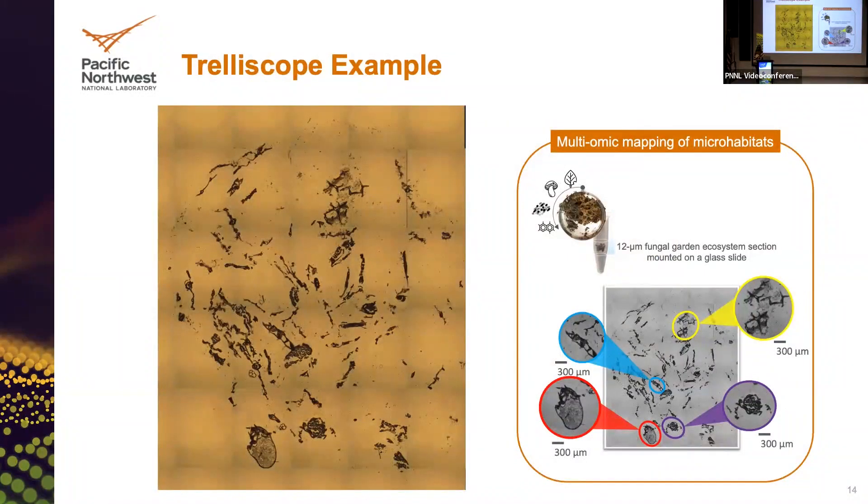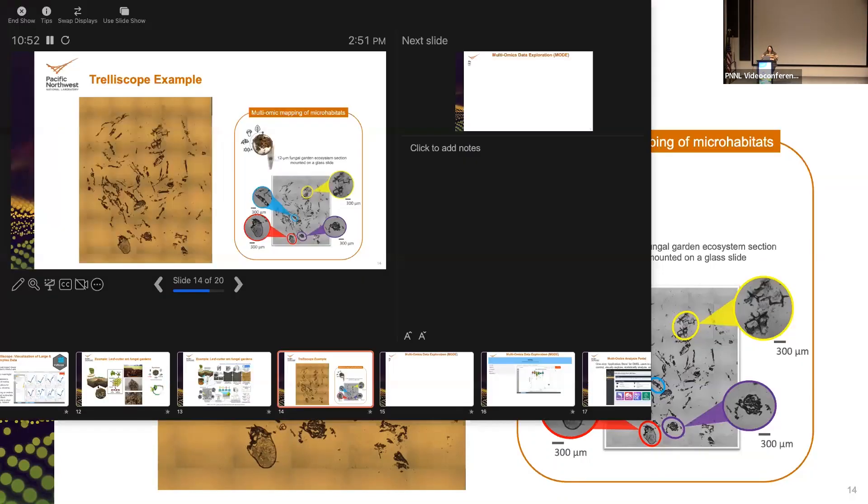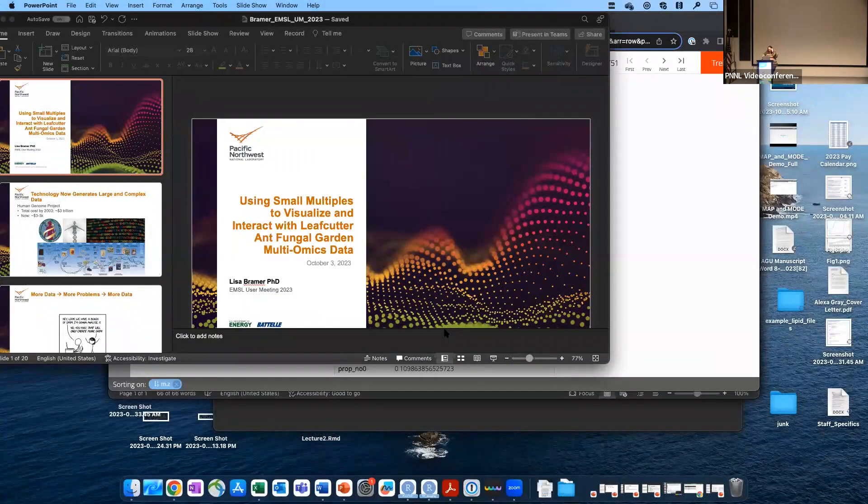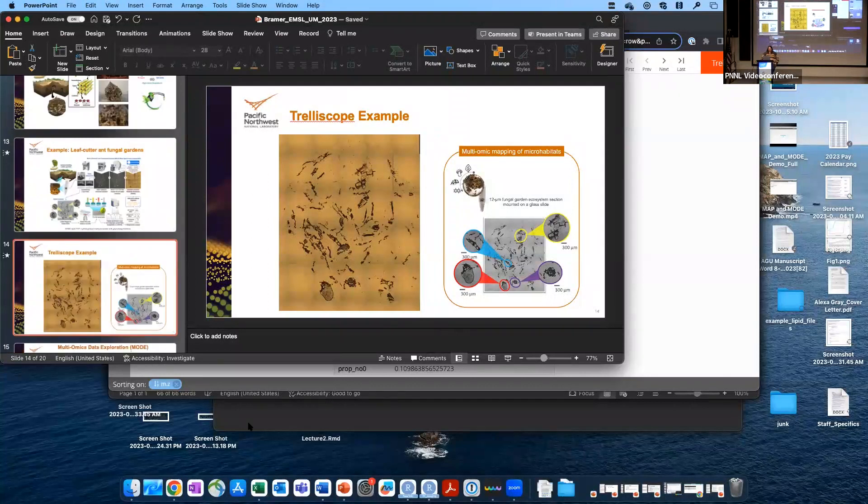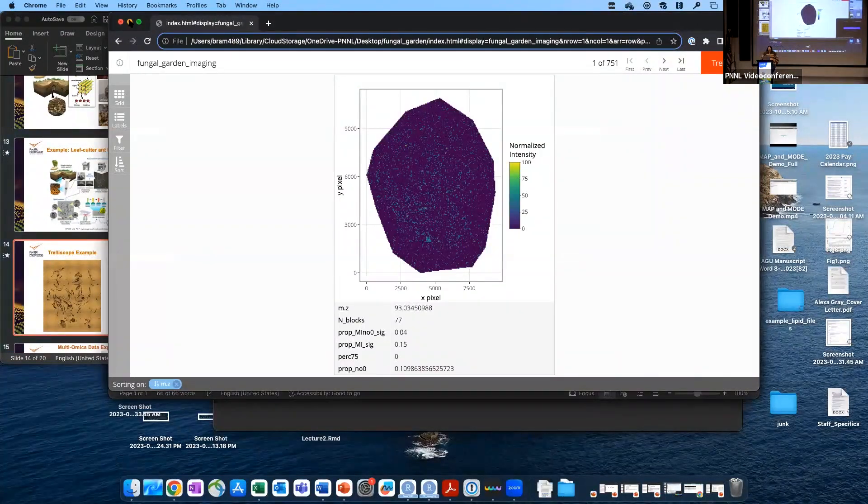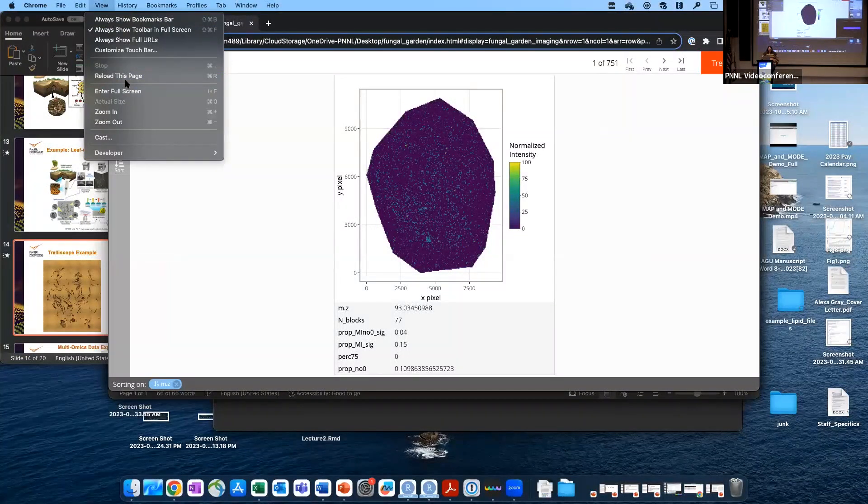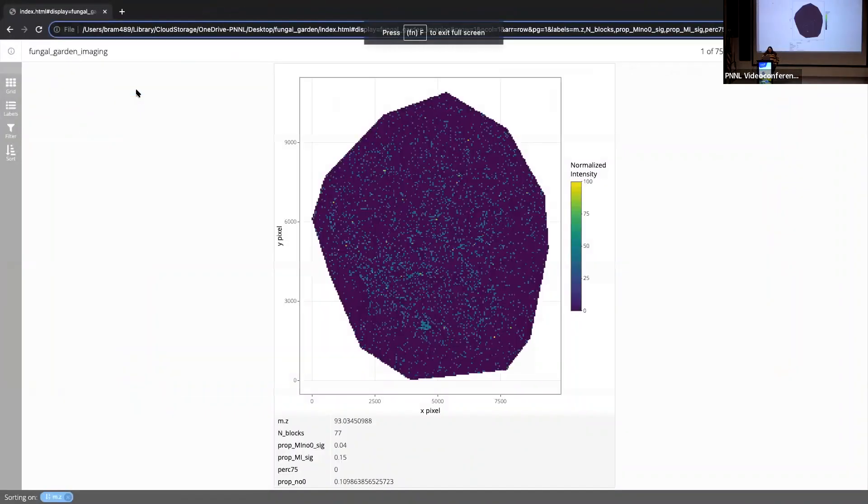So one of the studies that was done, this is a huge pipeline that Maria and Kristin would be happy to explain to you in detail, but I'm going to focus on what's at the top here. They took their fungal garden and they did spatial metabolomics on it and looked at what features they have and put that into Metaspace to try to do metabolite annotation. There's complementary spatial proteomics data that went with this. For today, I'm just going to talk about the spatial metabolomics. And I'm going to show you an example of Trelliscope. One thing I want to point out is at the bottom left of this image, you have an ant egg. And the rest of this is fungal material from that garden.